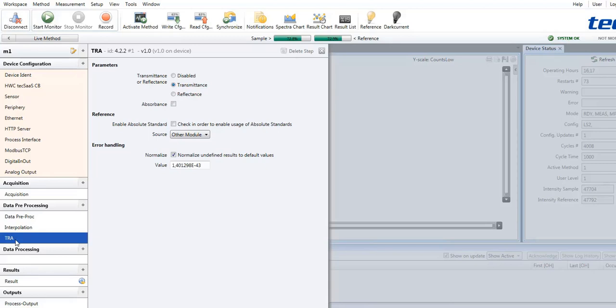Also, a reference standard may be selected, and the options for error handling may be defined here.